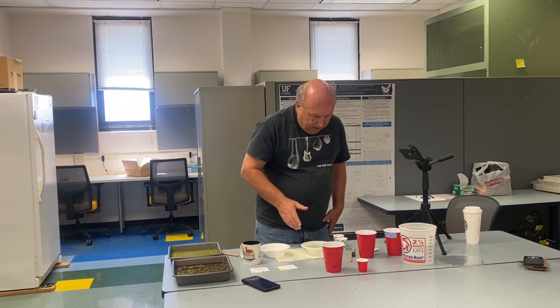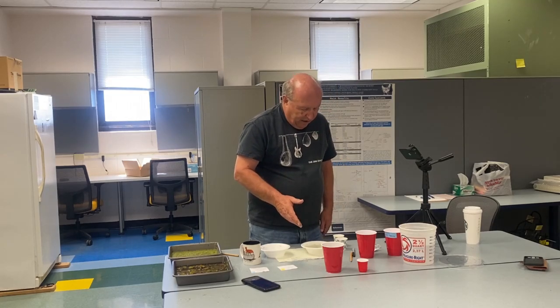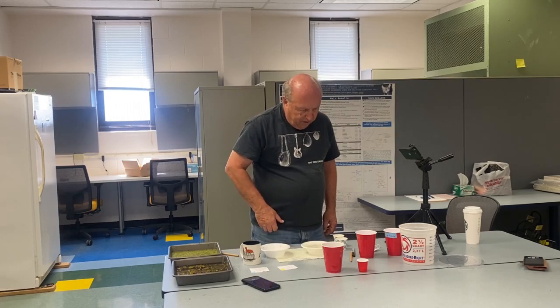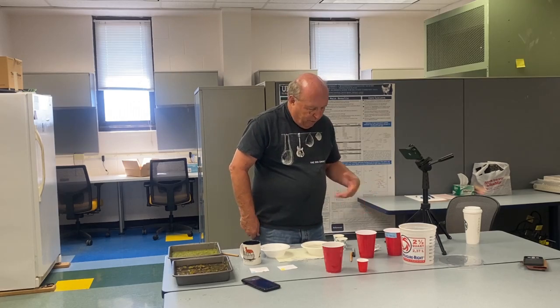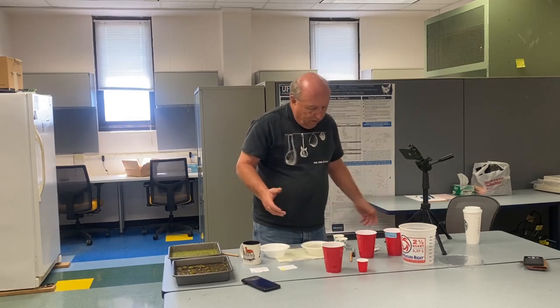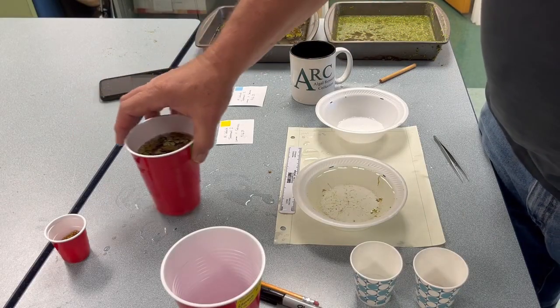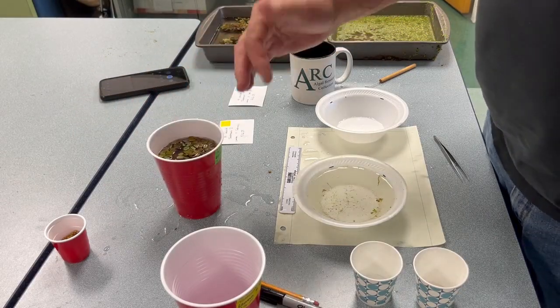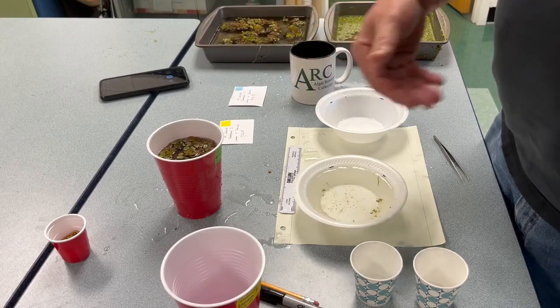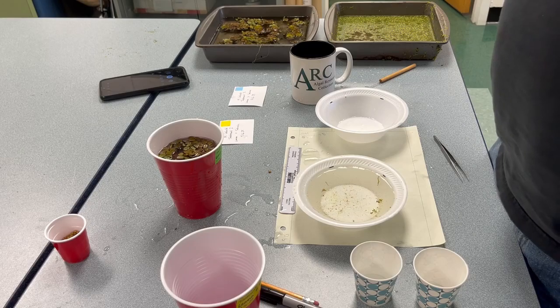That's it. You should write notes about any problems you might have had or anything like that in your book, so that in the end, if there's some problem, we have some reason to think, oh, there was a mess up, or no, everything went smoothly. You'll also want to try to keep the water level constant. And so every couple days or whatever, depending on how often your class meets, you can top it off with some more water.